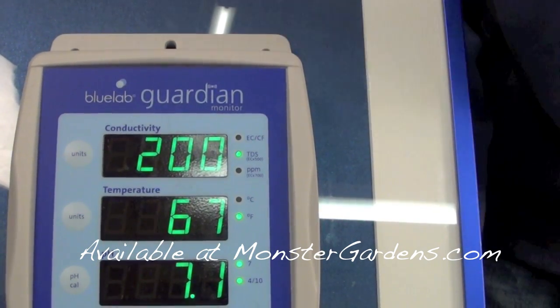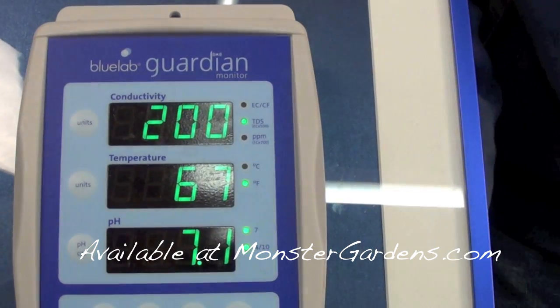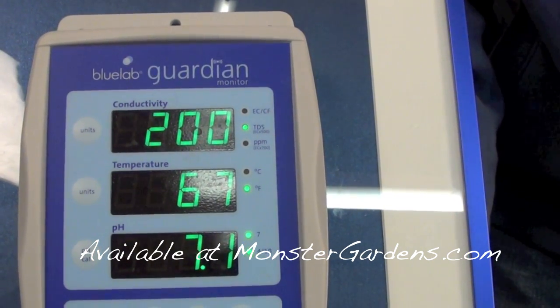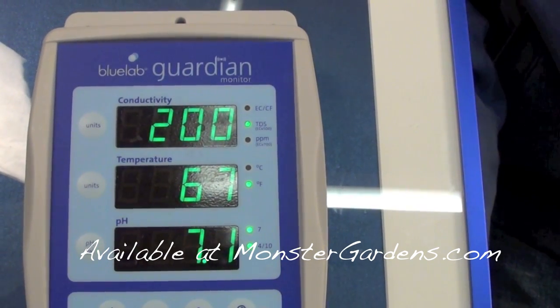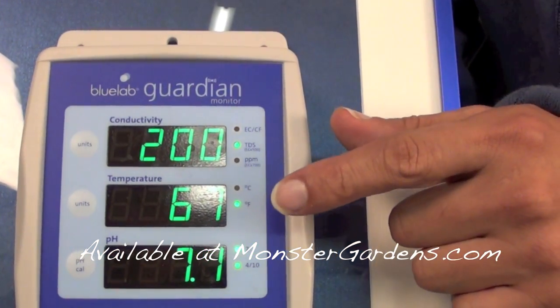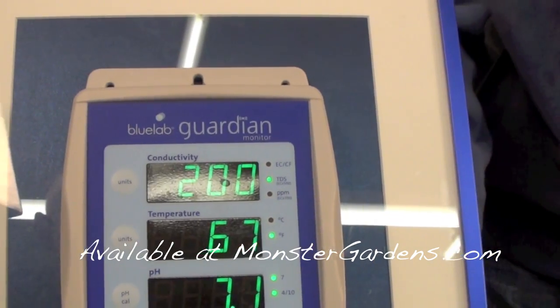In Australia they use a base of 500, and in the U.S. they use a base of 700. So you have to be careful when you go on websites and see a recipe with a specified conductivity measurement — make sure whether they're basing it on 500 or 700, otherwise you could be off. In the U.S. the most common would be 700, which is essentially PPM, and we'd be using Fahrenheit instead of Celsius. PPM stands for parts per million.